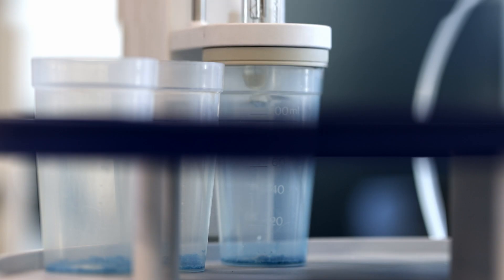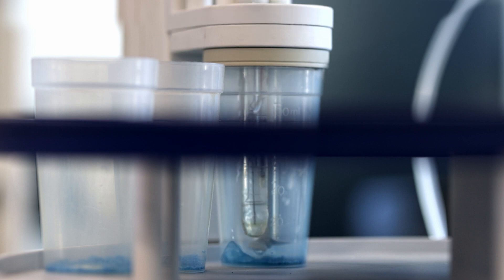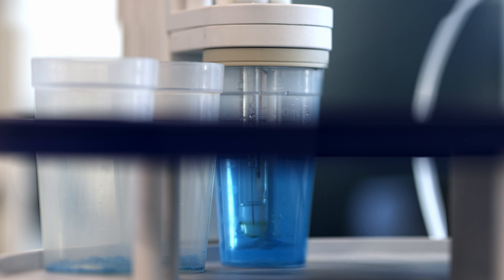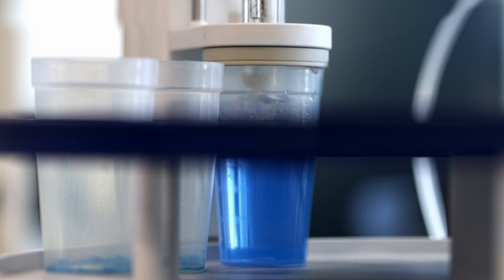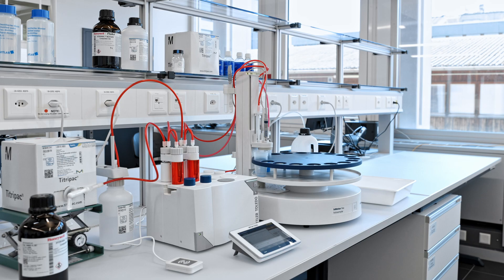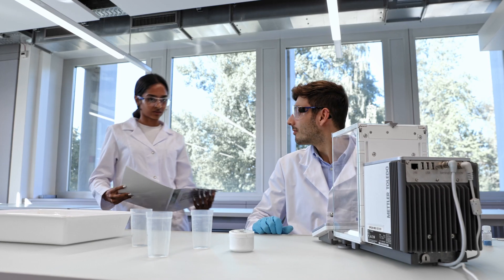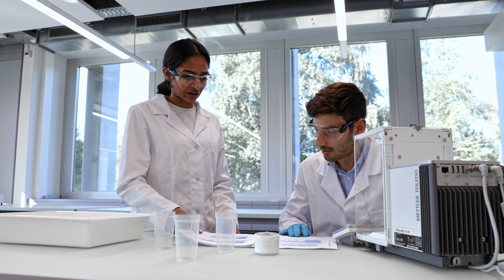The in motion auto sampler processes all the samples, including any further preparation steps such as dilution, rinsing, and draining. While the in motion is handling your samples, your time is freed up to perform other tasks.